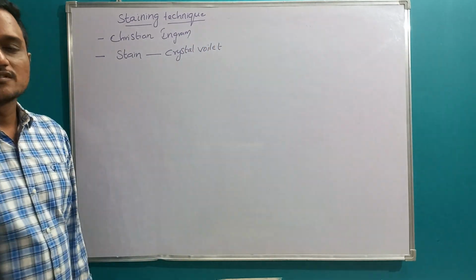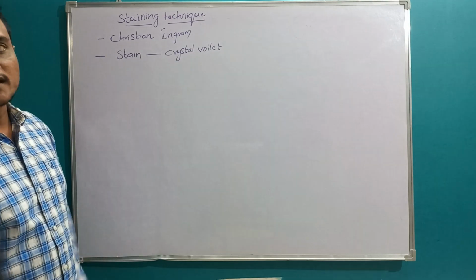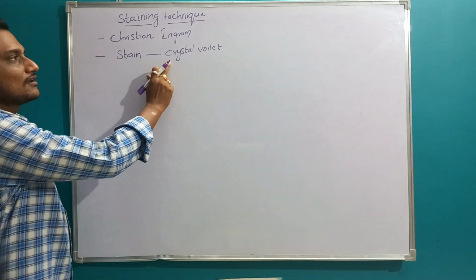The stain he used to stain the bacteria in this technique is crystal violet.